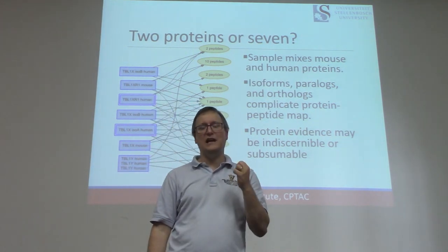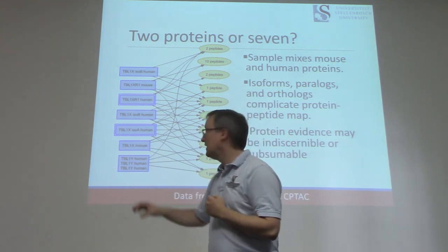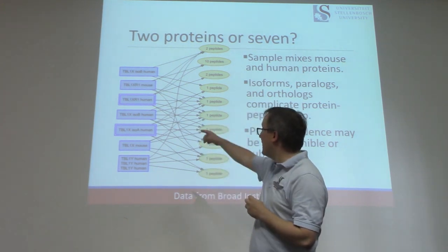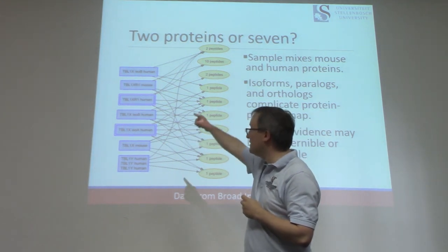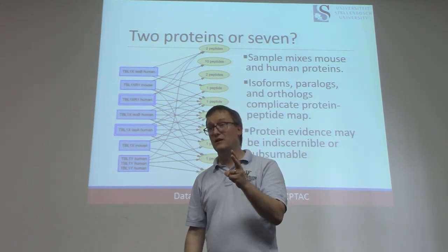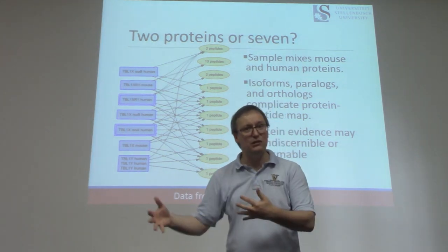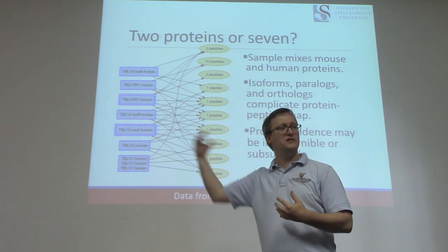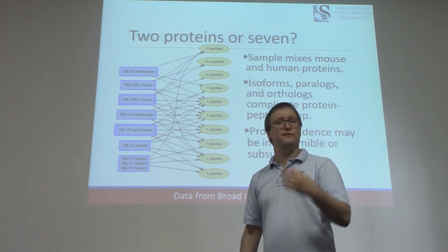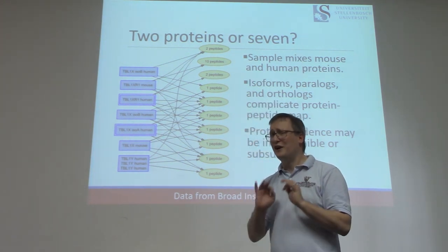Parsimony means that we need to account for the set of peptides we've observed with the most minimal set of proteins that can explain them. In this case, you could claim all seven if it were the late 1990s, but under publication rules today, you would need to have a parsimonious list instead. And the two proteins that we've put in a double box here, those by themselves are capable of what in graph theory we would call a set cover. Those two proteins explain all of the peptides we've observed. That is a difficult thing to untangle because we have these very complex relationships between proteins and peptides that could be generated from them. So when someone gives you a proteomics paper and they say, "We found 2,560 proteins," it is worth your asking, how parsimonious is that list? Because lots of people are very non-cautious about this.